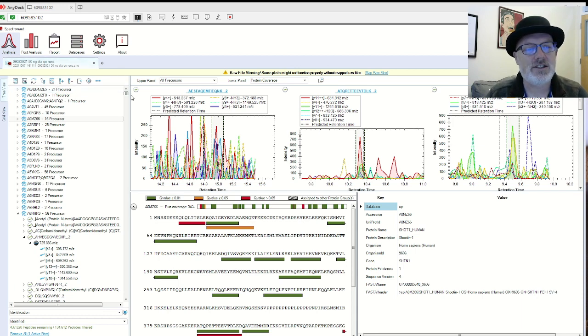Okay. So let's go over how to change some of the fundamental things about how Spectronaut does its processing. I am using the viewer just like you are, so I am not using anything proprietary with the commercial non-viewer software. The viewer can do almost 95% of what we do with the non-viewer software, but there are a few things that it limits you to.